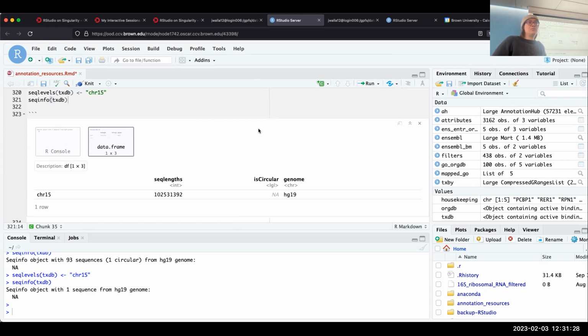The other question I had, Jocelyn: when you change the seqlevels style, UCSC to Ensembl, for example, or NCBI, do you lose anything? How do the unmapped, unplaced and random contigs get figured out, because they're different across different sets?